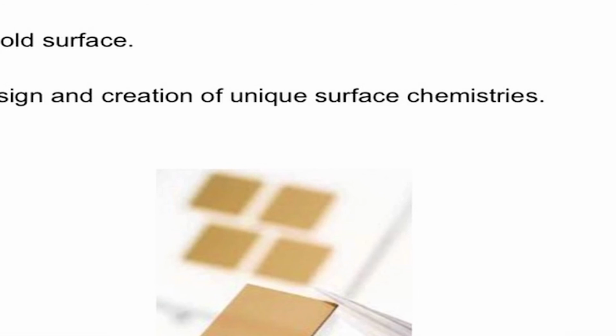Another surface is a plain gold surface, where there is no dextran, and these surfaces are very good for chemists, who can do their own chemistries and use them for interaction studies. Nowadays, there are also plain gold kits available, and these kits have portable gold surfaces. The portable gold surfaces can be taken into a laboratory, and you can do the required immobilization of the molecule, then insert it into the chip cassette and into the Biacore system for studying the interaction.